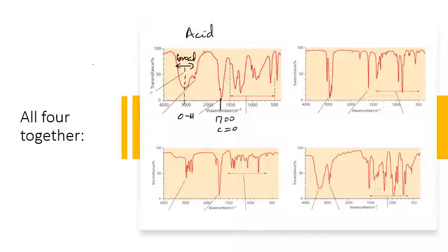All right, moving on to the right here, this is our main one here at 1,600. All right, so it's about 1,600. So this is our carbon-carbon double bond. All right, so this is our alkene. All right, don't be confused by this one. This is just our carbon-hydrogen peaks. Very distinctive, but it doesn't really help us much, given that carbon-hydrogen bonds are in every molecule. Okay, so we can say that that is our alkene.